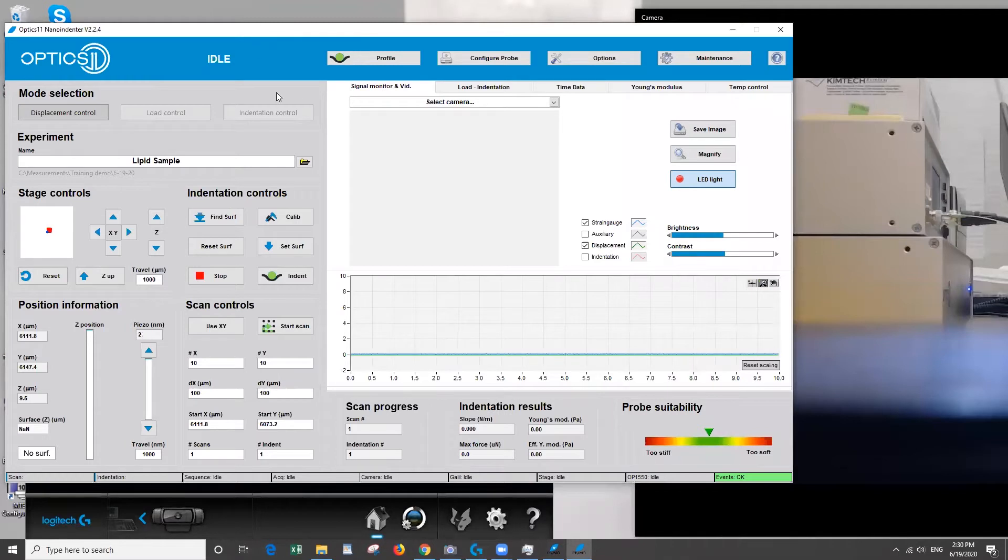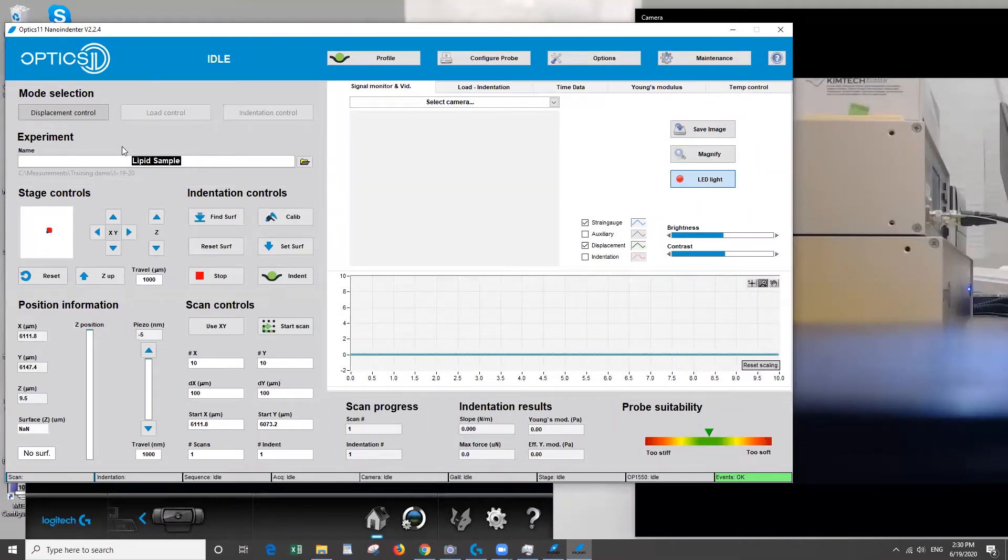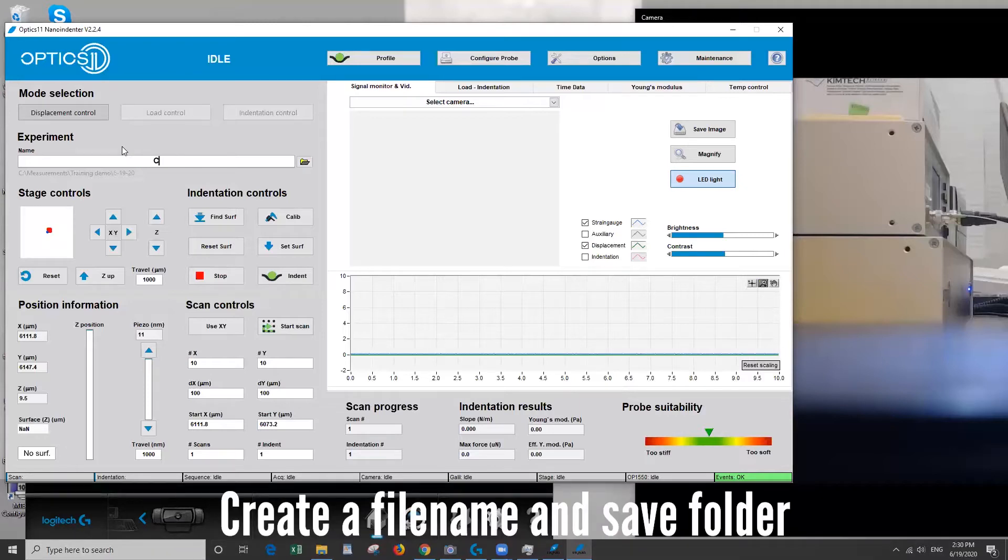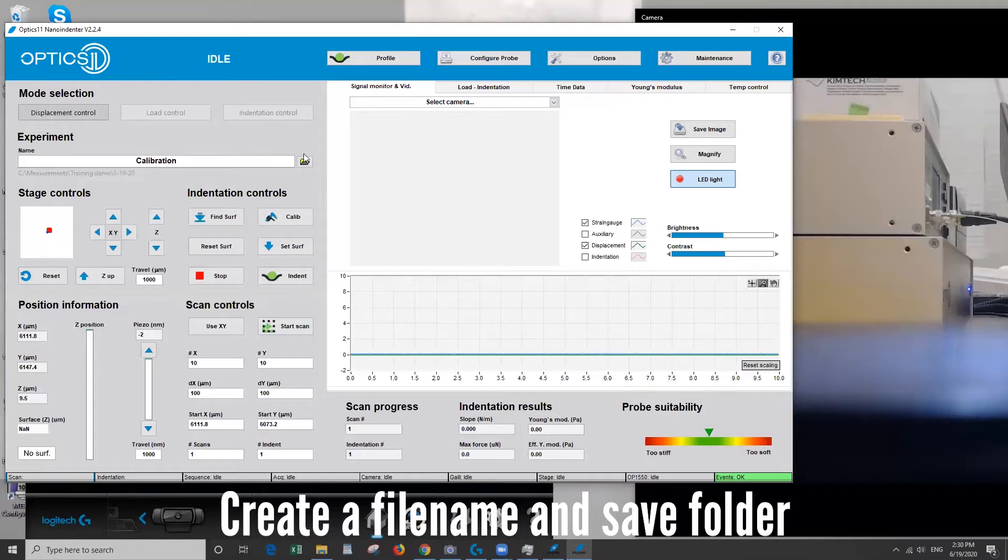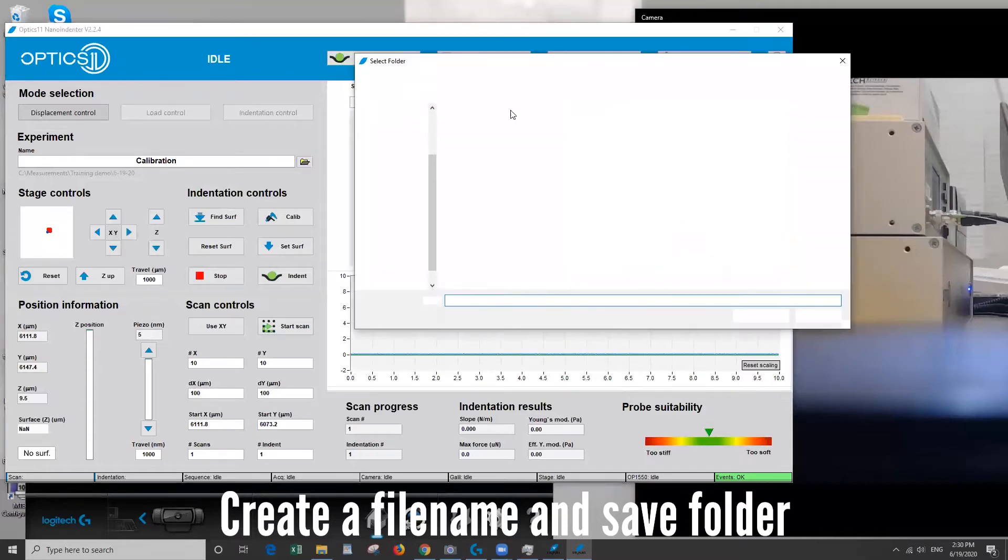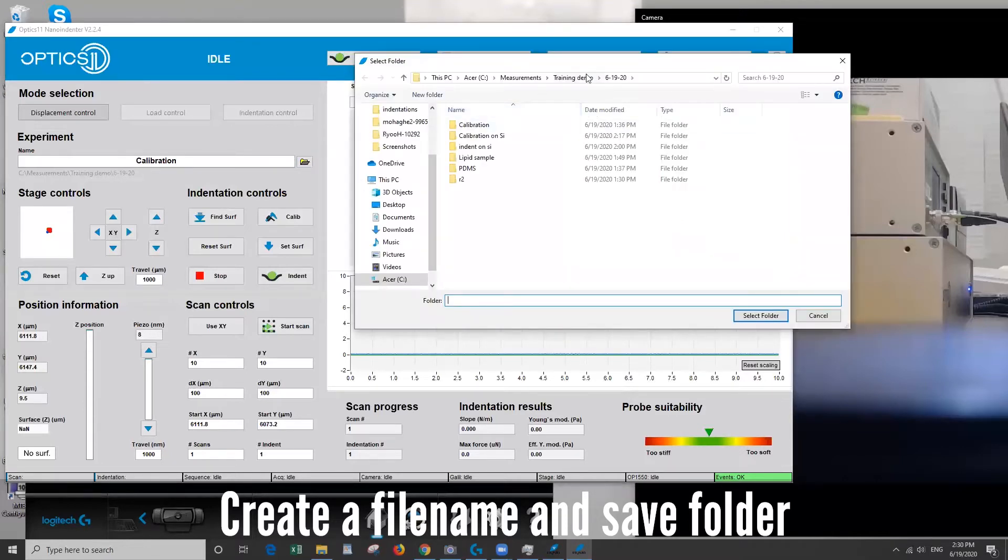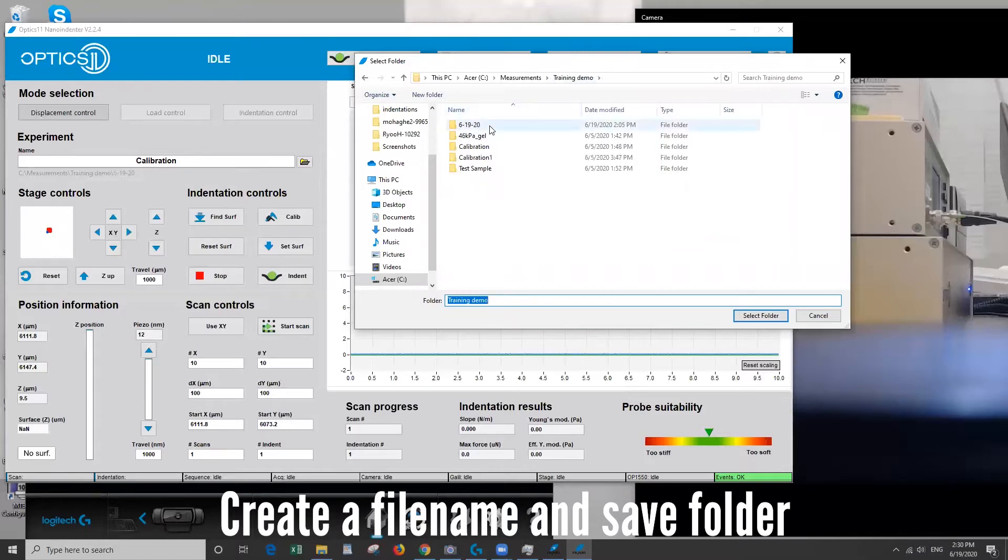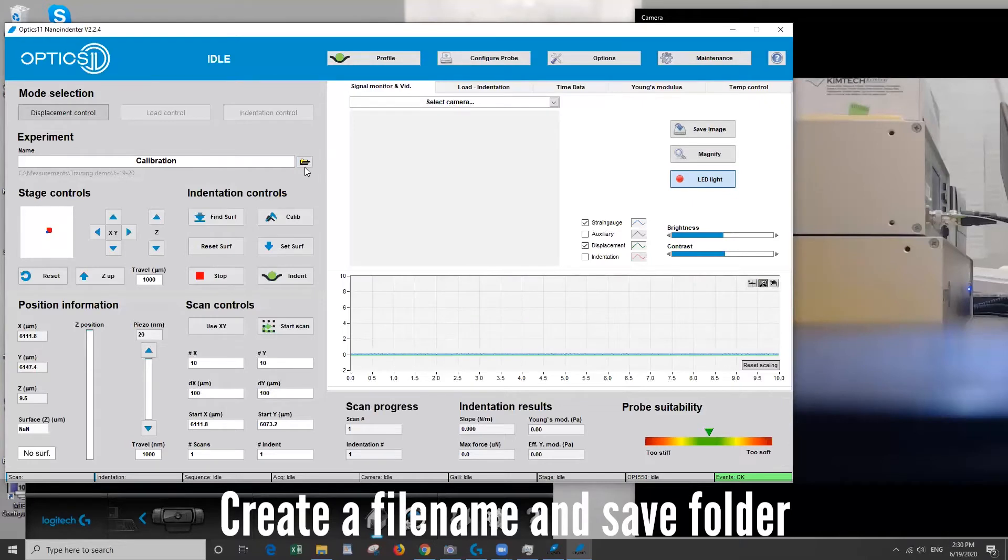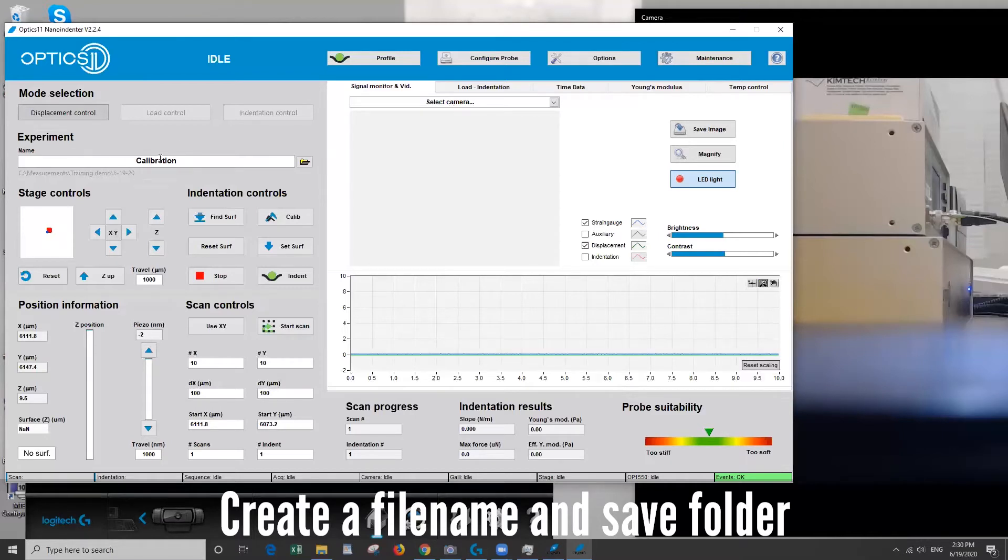All right, so first we're going to come here and name our experiment. So let's choose calibration and make sure it's going into a folder on the computer that's your folder. So here we'll be doing training demo. I'm going to choose today's date and just select the folder. It will make a new subfolder with the calibration name so you don't have to worry. Every time you rename the file here it'll make a new folder.